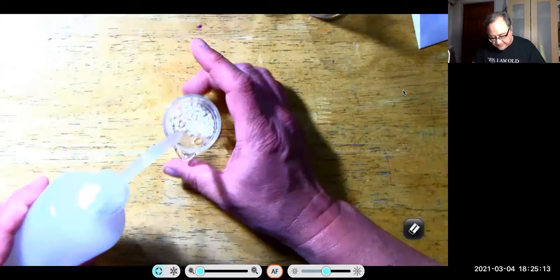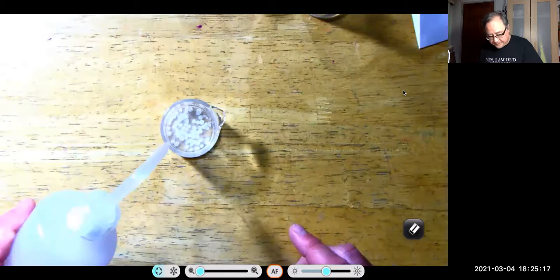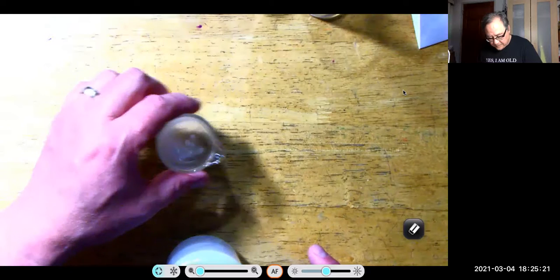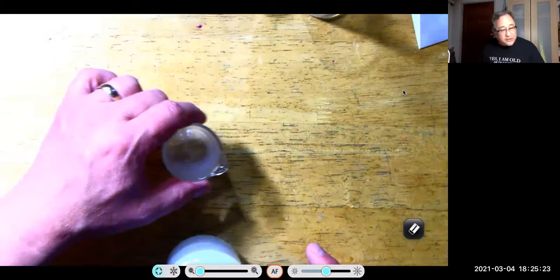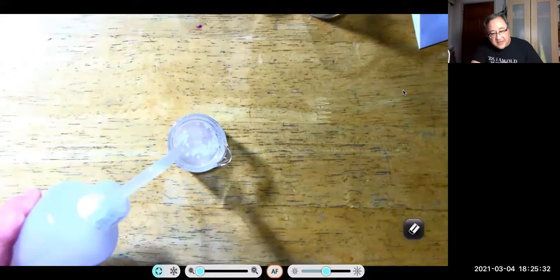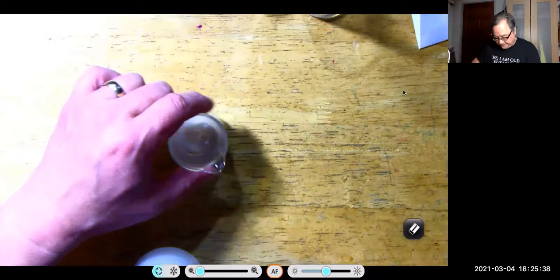Now this stuff doesn't dissolve as well as your carbonate. And I'll show you what I mean here in just a moment. So again, I'm trying to use the minimum amount of water to dissolve this. And for this one, I really don't mind if I use a stir rod, because if I lose any of this, it won't matter because it's in excess, as long as I don't lose too much.